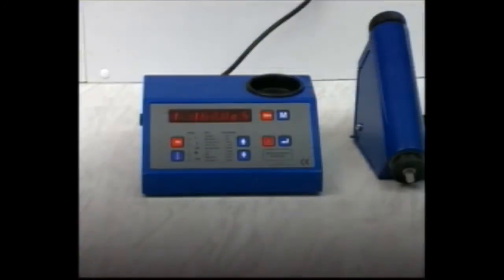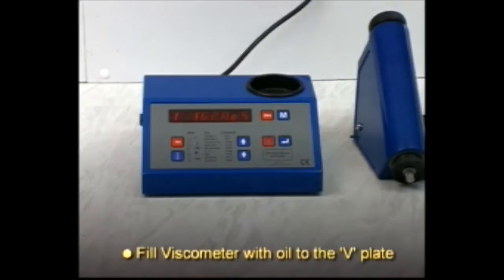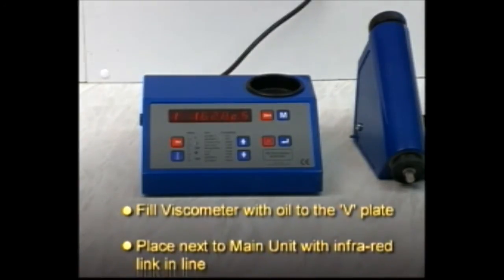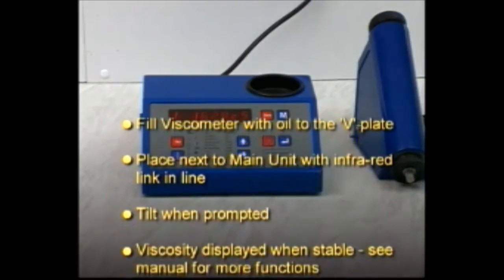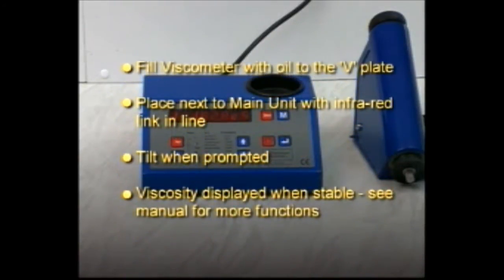To summarize, fill the viscometer with oil to the V-plate. Place it next to the main unit with the infrared link in line. Tilt when prompted. Viscosity displayed when stable. See your manual for more functions.